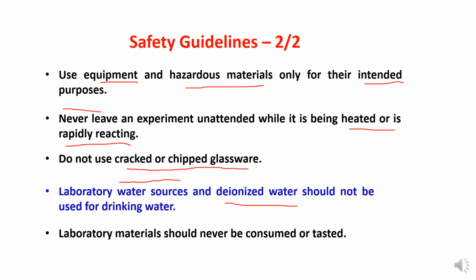Lab materials should never be consumed or tasted. This is a general rule, although it contains some hidden information, because the chemicals or materials that belong to the lab are not 100% sure to be usable for eating purposes or other domestic uses.